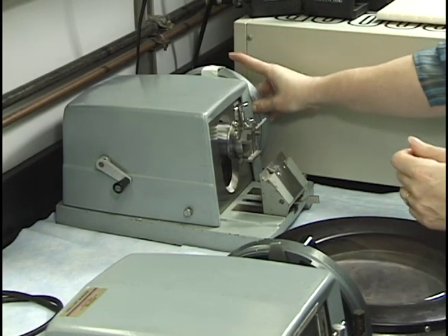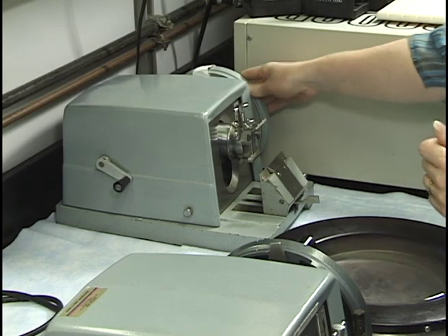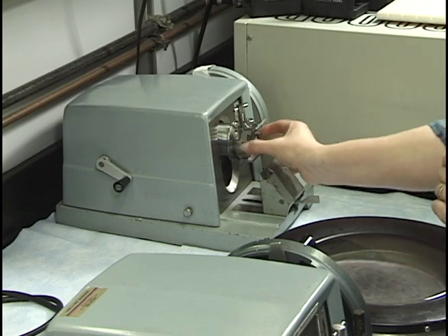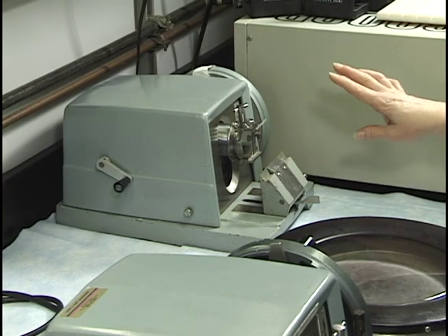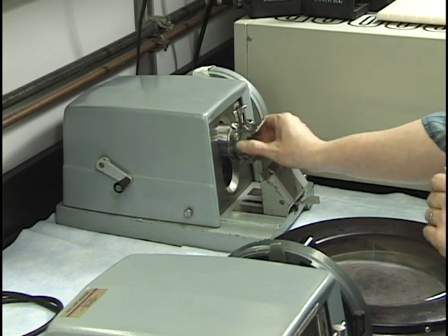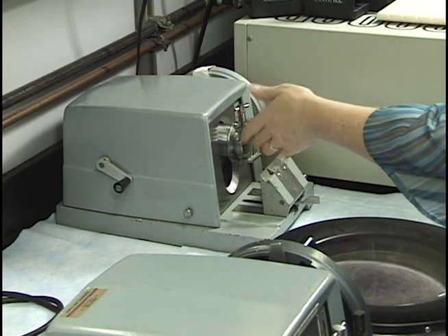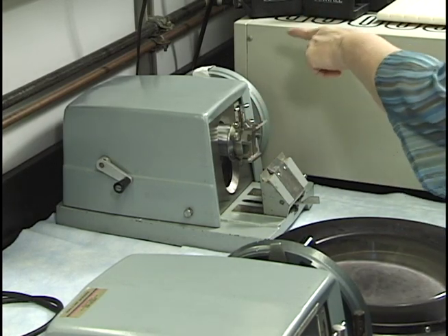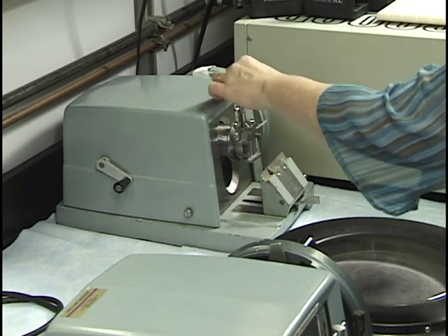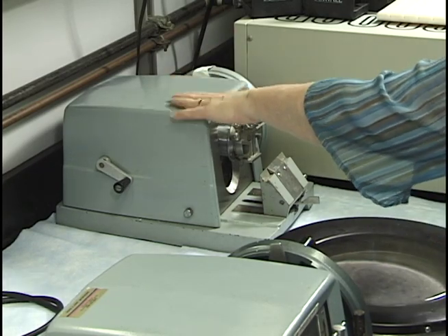This one, the safety lock spring is broken, and it's kind of a rare find to find another one, so I don't recommend using it. Another thing that's broken is the thing behind the chuck holder. There's a pad that holds this in place, and it's allowing it to have play no matter how much you tighten it because there's a portion of it broken. So there's more wrong with this than just that safety. What would have to be replaced would be the whole ball unit with this clamp lever. So just for your information, if somebody wanted to fool with that microtome.